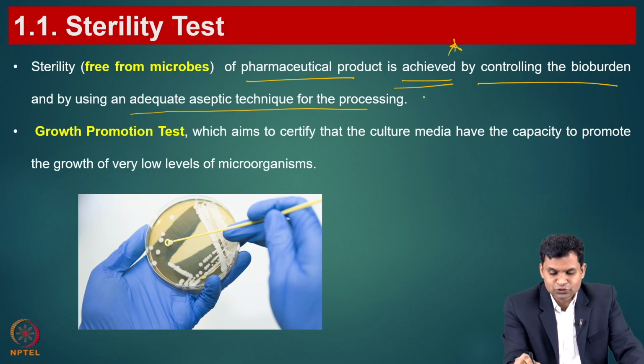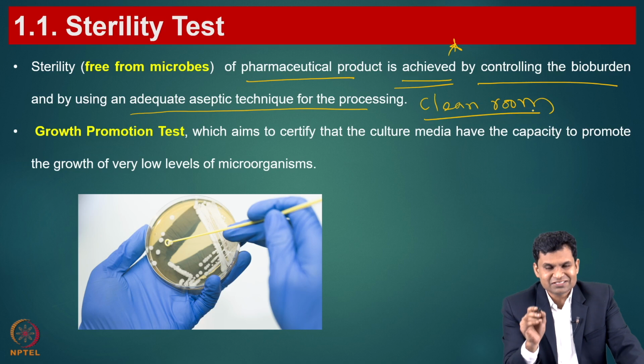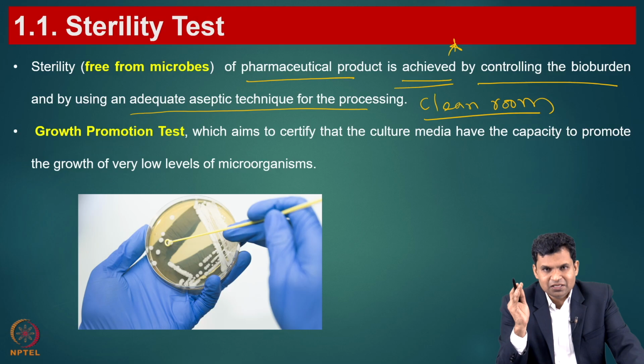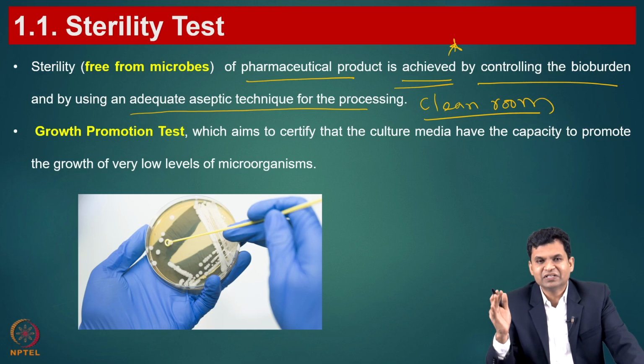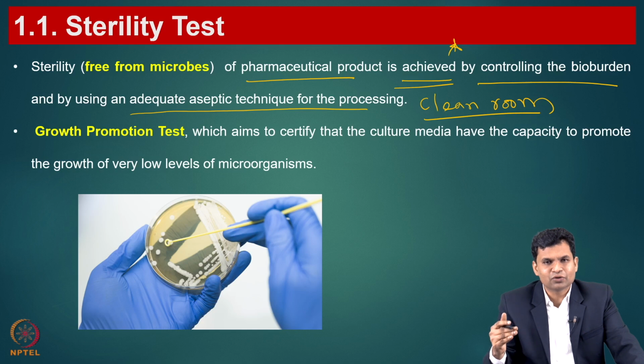For example, these are also known as clean rooms. Here the particulate matter as well as the airborne microorganisms are controlled. A clean room is one where the airborne particles as well as the microorganisms need to be controlled in that environment. Then only will we call it a clean room. This is further classified into clean rooms of class 100, 1000, 10,000 and lakh.